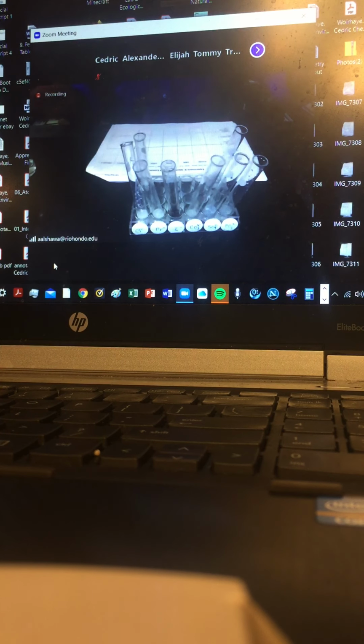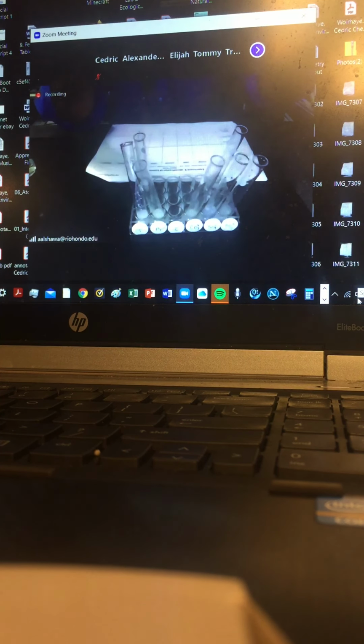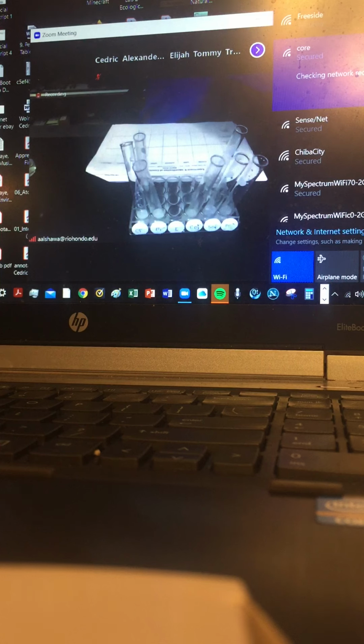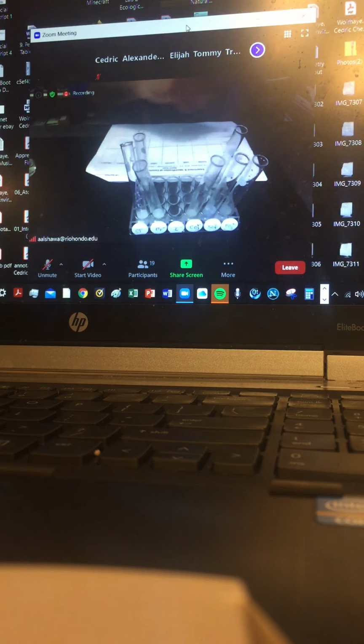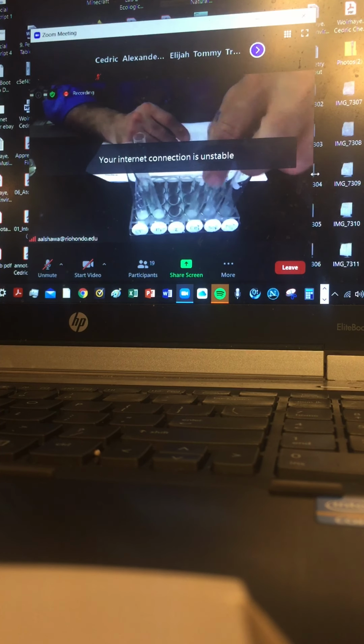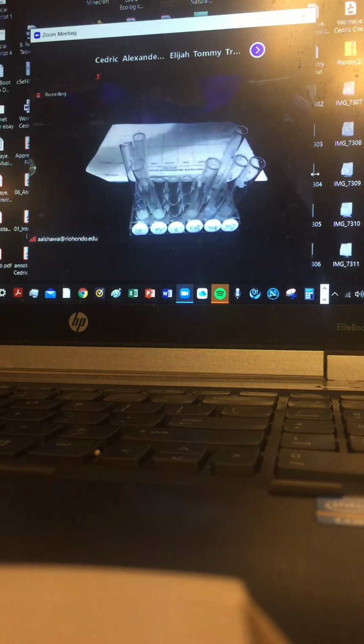Okay, so just expose my solution. Either the test tube was contaminated, or the solution itself is contaminated.